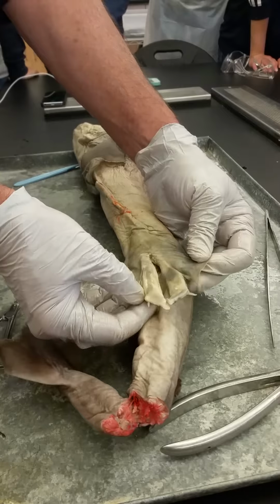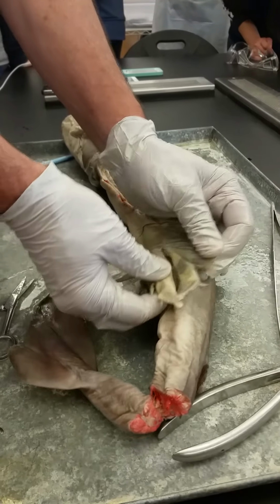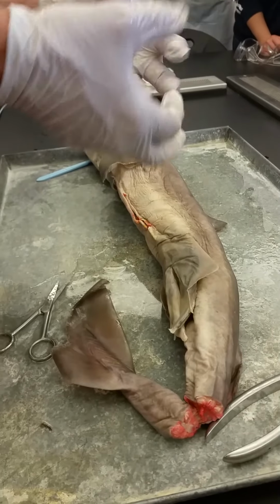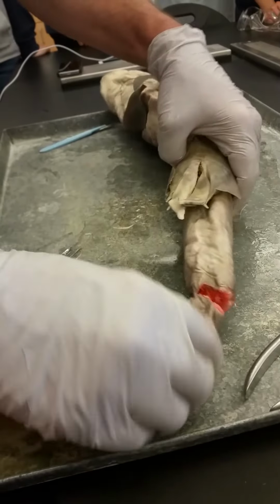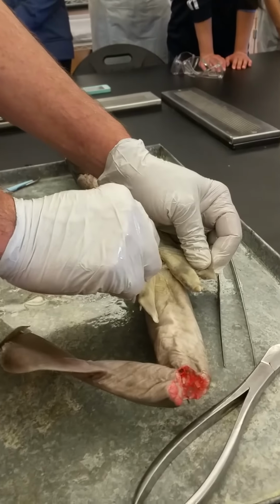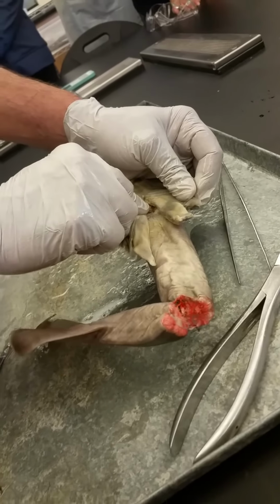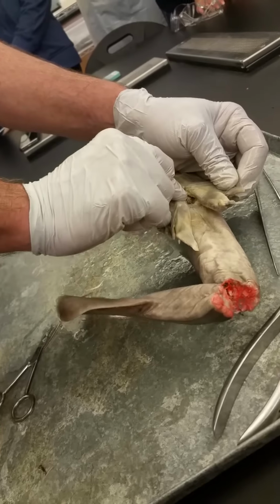And there's one on each side. Originally, when people saw these, they weren't sure what they were for. They thought maybe they were holding the female with them, hence the name clasper. But we now realize it's actually the copulatory organ. When copulating, here's what we call the anus, but it's actually the cloaca. Remember, a cloaca is a common opening to the digestive, excretory, and reproductive systems. So that's where sperm would come out.